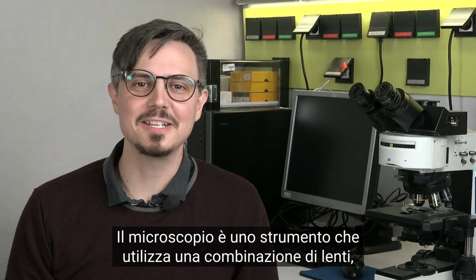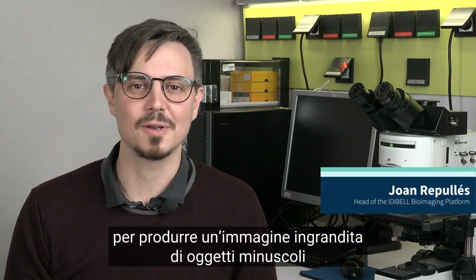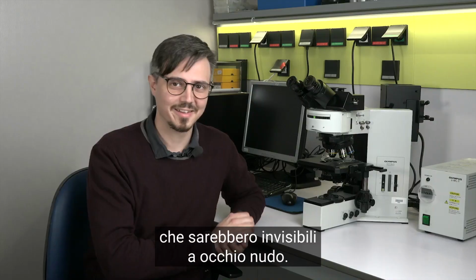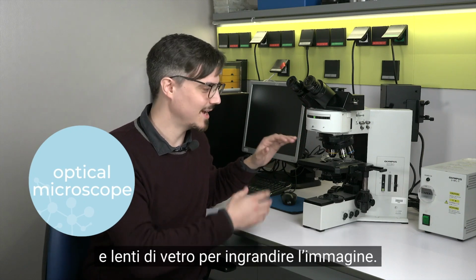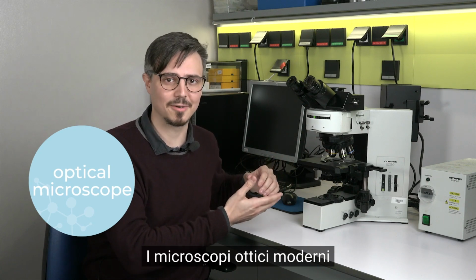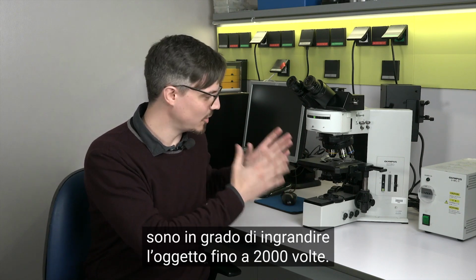A microscope is an instrument that uses a combination of lenses to produce a magnified image of a small object that will be normally unseen under the naked eye. In optical microscopes, we use light to illuminate our samples and glass lenses to magnify the image. Modern optical microscopes can magnify up to 2000 times the object size.